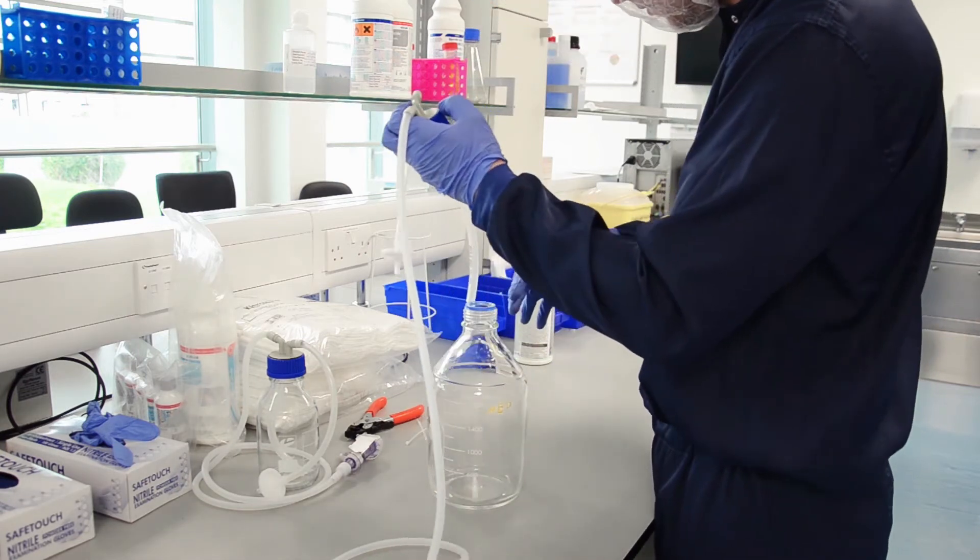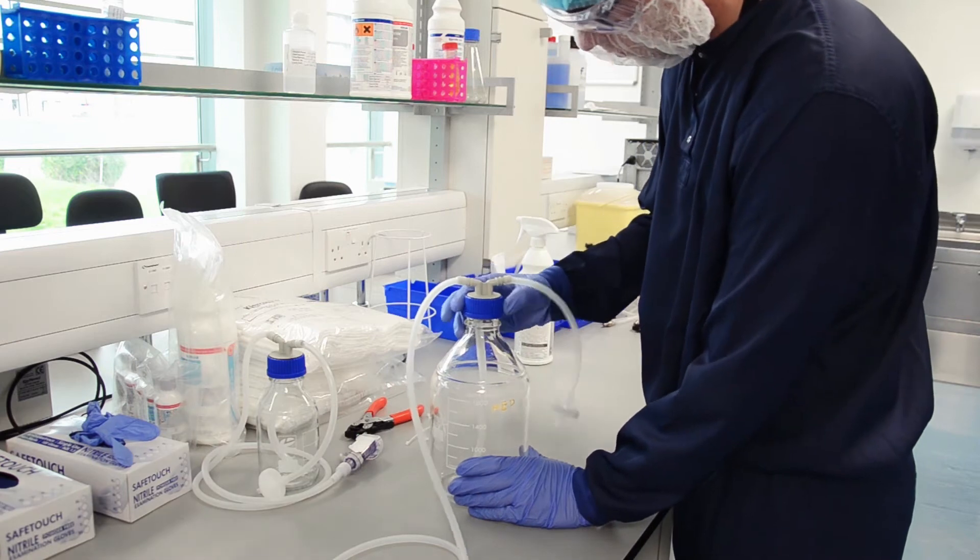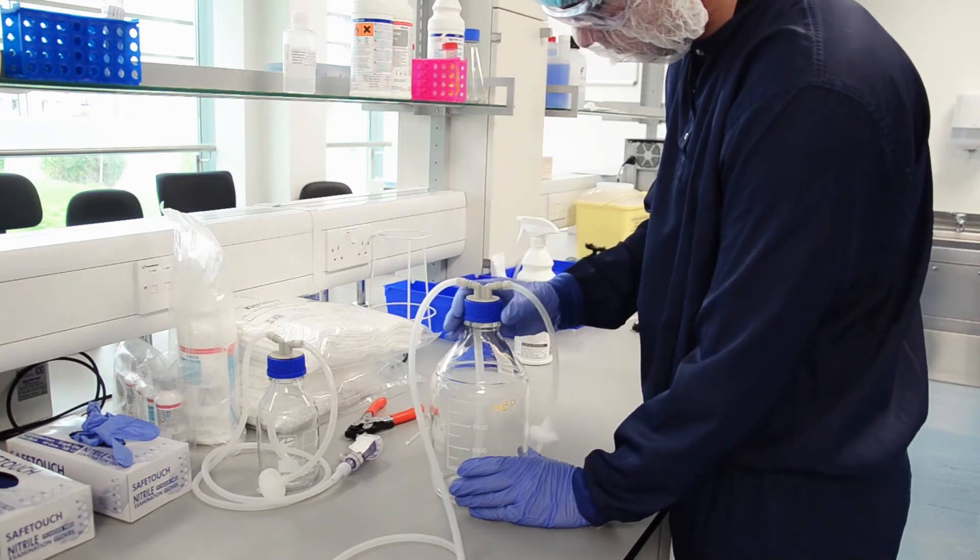Another piece of long tubing is connected to the same line on the connection. Media will flow out of the bottle and through this piping into the reactor.